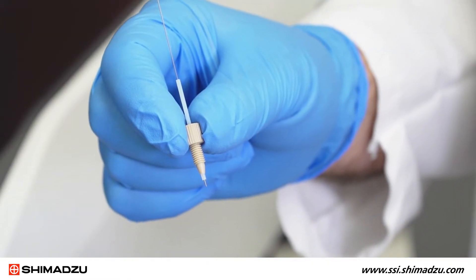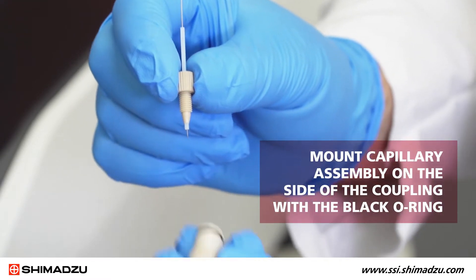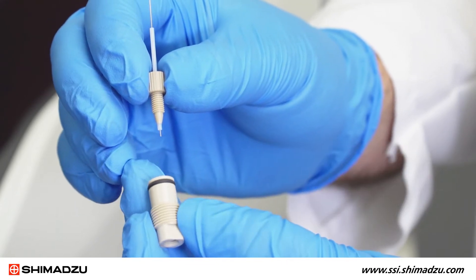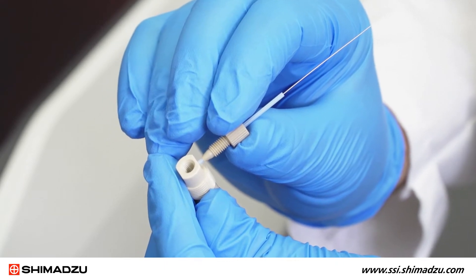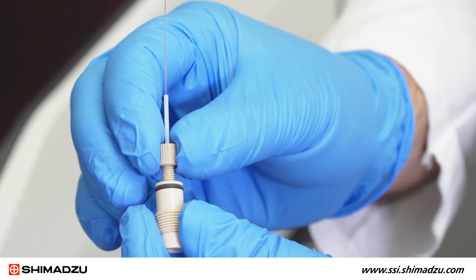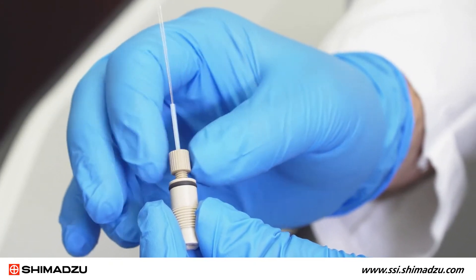Now the new capillary assembly can be mounted into the ESI coupling. This must be done on the side of the ESI coupling with the black O-ring. Use the side of the coupling to help ensure that the tip of the ESI capillary is not recessed too far into the assembly or projecting too far out. Now you can screw the capillary assembly into the coupling and finger tighten.